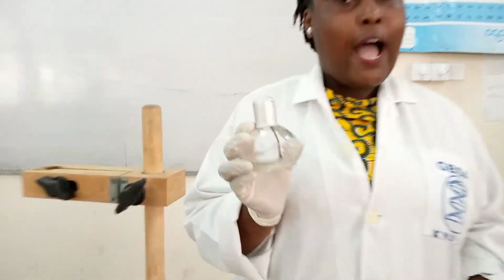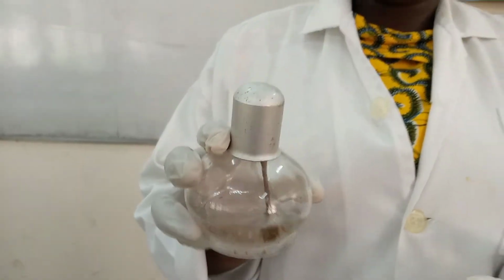So this is my unknown sample. This is ethanol lamp or alcohol lamp. It is called alcohol lamp because the liquid in it is ethanol or alcohol. I have here with me my mercury thermometer. This is what I will use to record the melting range. I have here with me capillary tube. I have here matches.